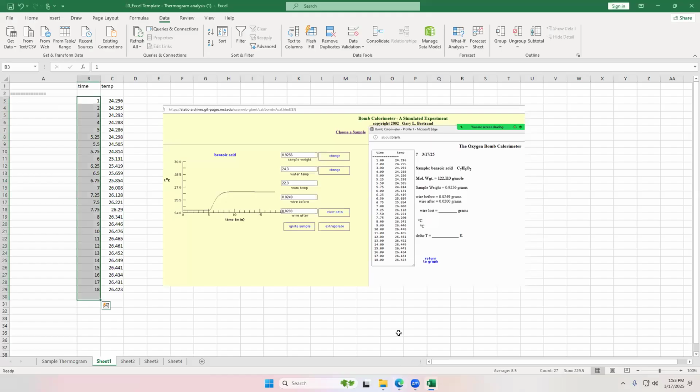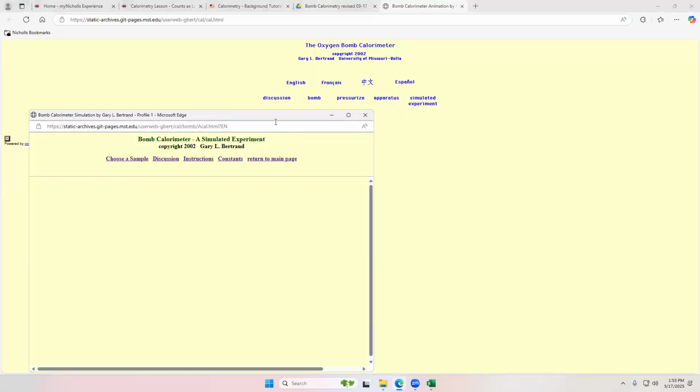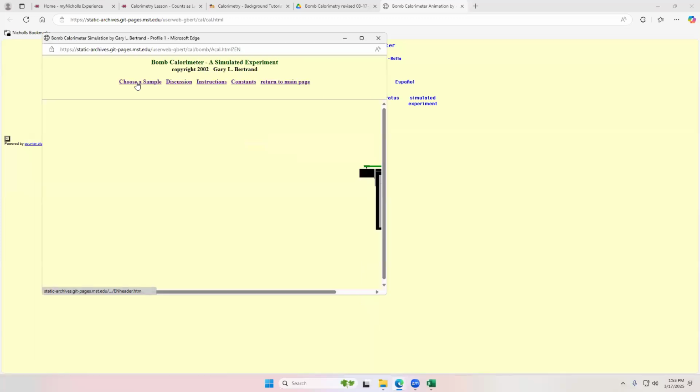So go back to your simulator. Where's my simulator? Where I lost it, right here. So go back to simulated experiment. Choose a sample.